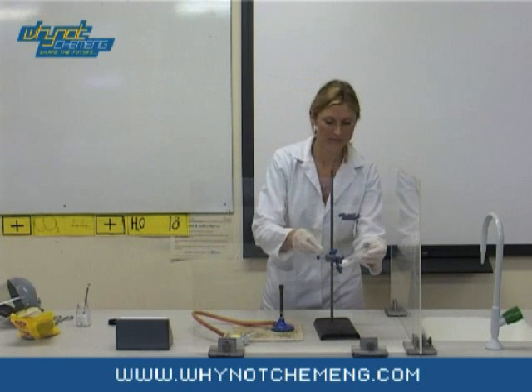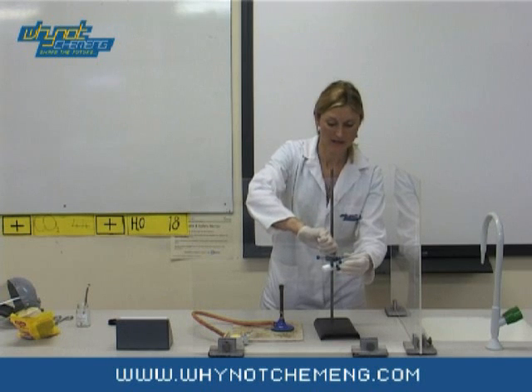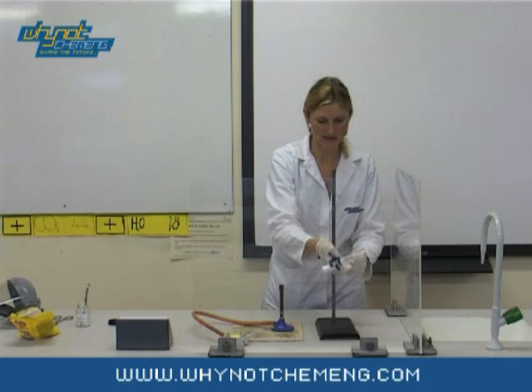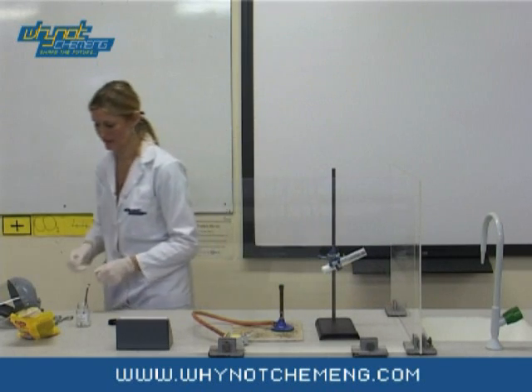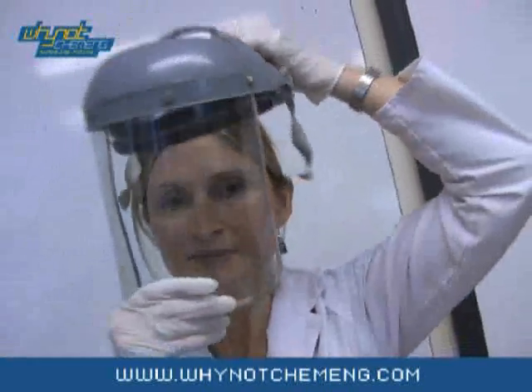Put the boiling tube into the clamp stand as shown, at a 45 degree angle pointing towards the safety screen. You will need a protective face shield for this demonstration.